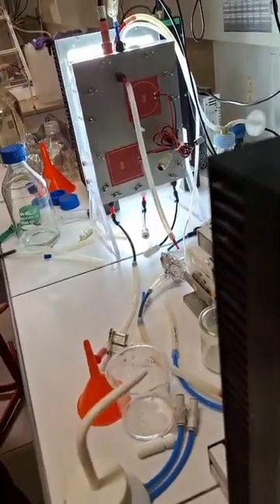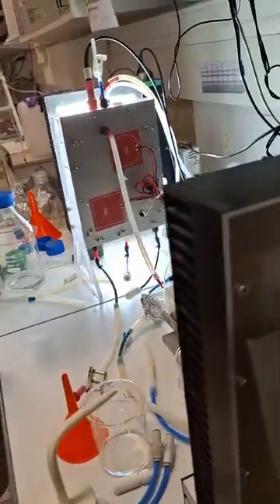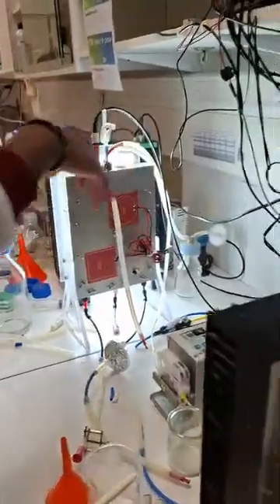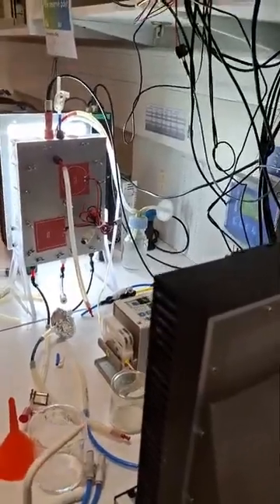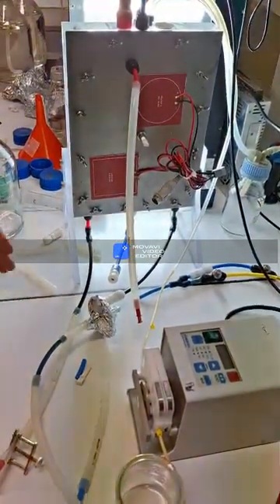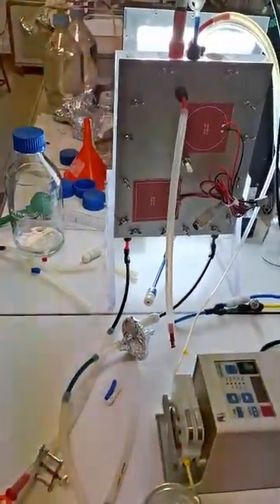So we will leave it around 20 minutes more with a little air injection. When we put microalgae in this, after 40 minutes, after rinsing. Because if you look at the pH, you are at 3, and for microalgae it's too low. So you die instantly. And we have to filtrate this also? No, no filtration. You just have to discard this and replace it by just distilled and autoclaved water twice.